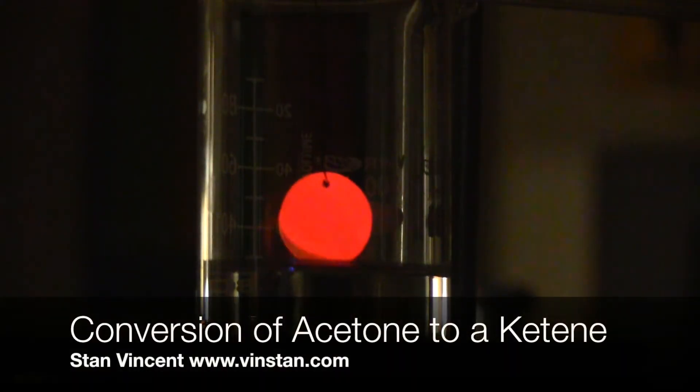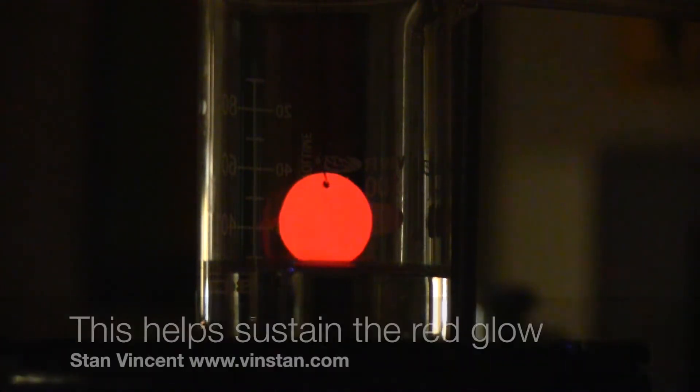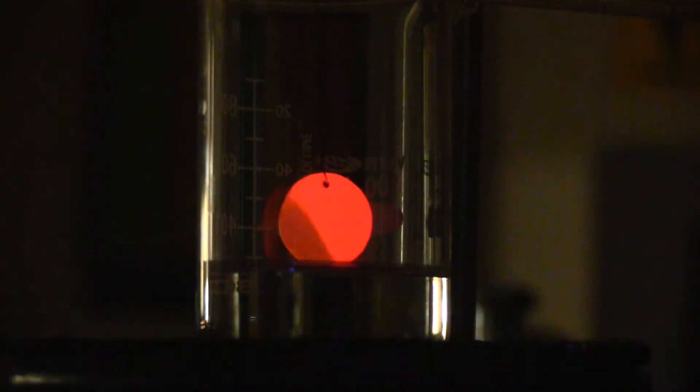Acetone on heating is converted to a ketene, which is an exothermic reaction. This sustains the red hot glow of the copper penny.